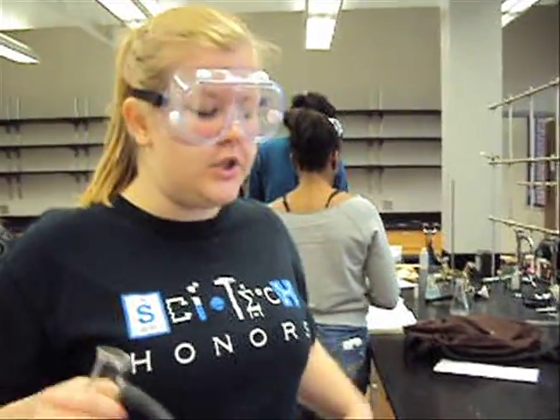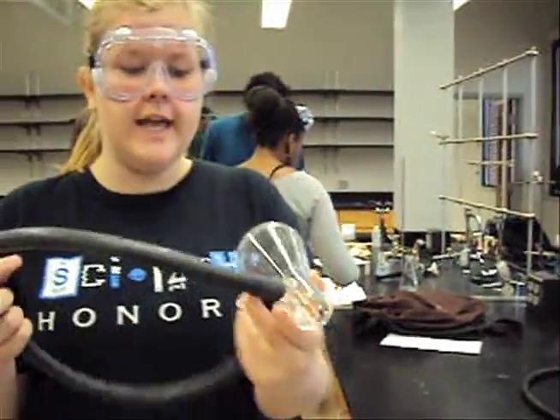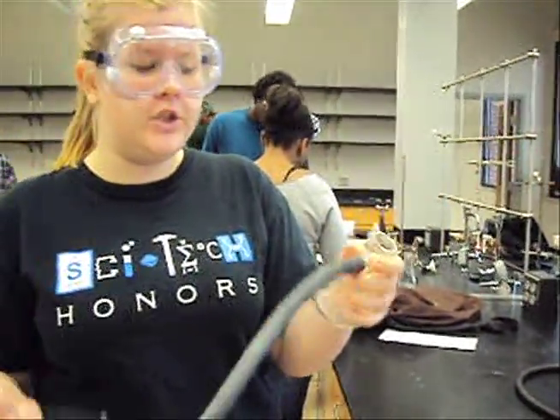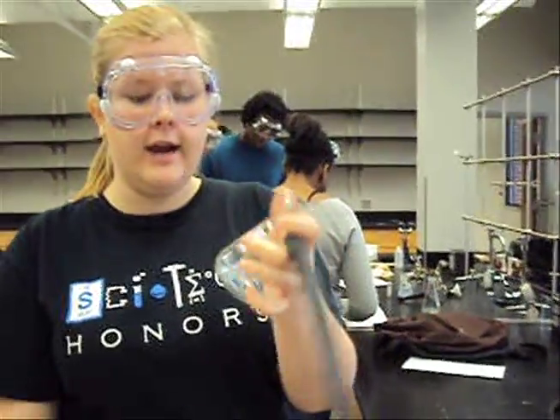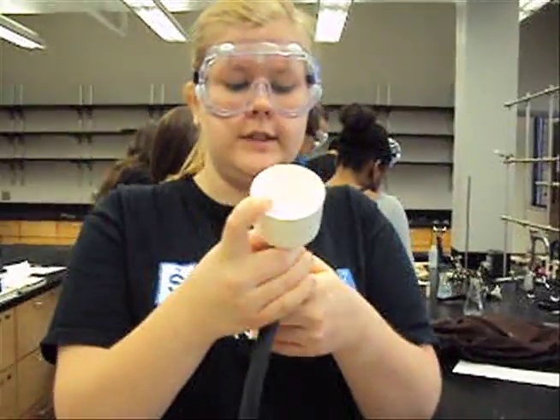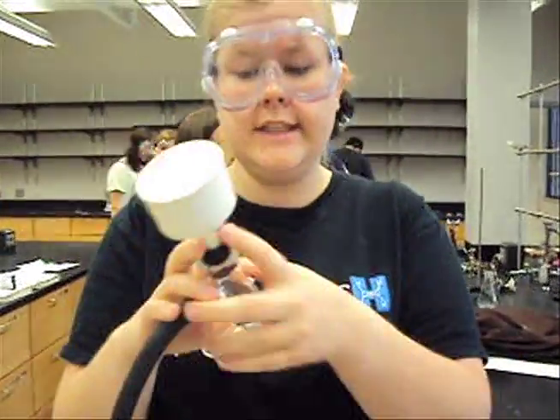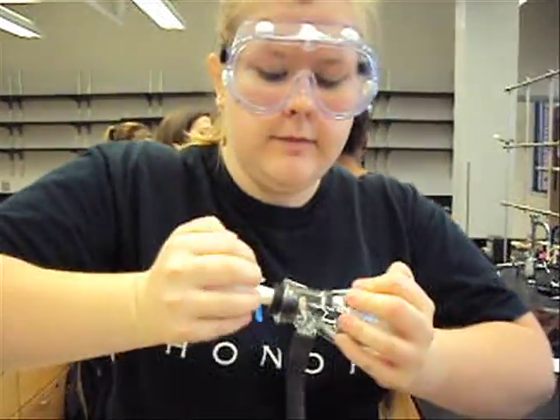Hi, I'm Caitlin, and I'm here to show you the setup for vacuum filtration with a Büchner funnel and filter flask. This is our filter flask. It has tubing attached to it to suck air through it. And then this is our Büchner funnel. You want to stick this in here — there's a rubber stopper on there so that it gets a good seal — and you want to stick that in there really tightly.